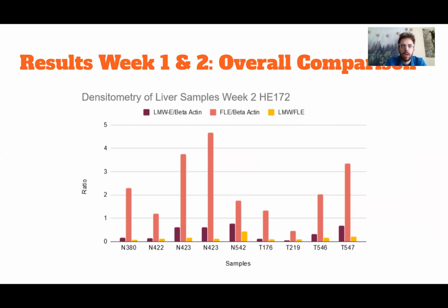And again, we use beta-actin to say, let's say, I think we used the example earlier in the semester, last semester was like, so we put like an amount in each one. So then we say, okay, there's 5 Dr. Yangs in this lane, 5 Dr.